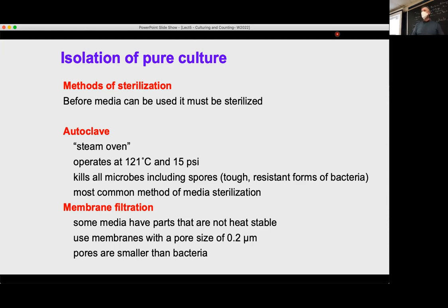I used to make oatmeal media, and the oatmeal media was so dense. We would sterilize it, pour it out into agar plates. It often got contaminated. So we would have to extend the cooking time, not to just 40 minutes, but maybe like an 80 minute cooking time. And it took forever to make, but eventually we figured out how long it took.